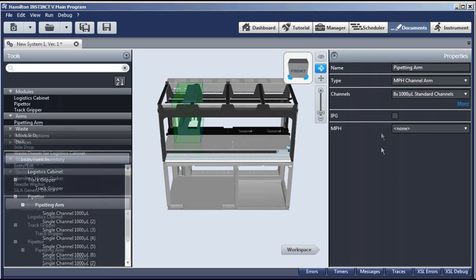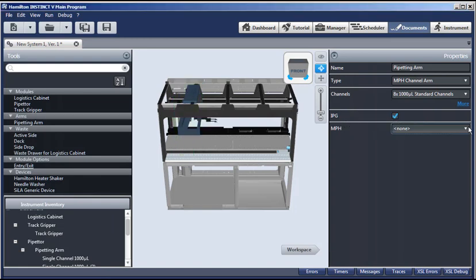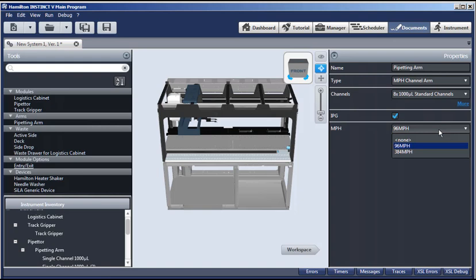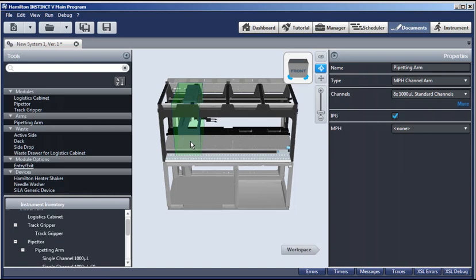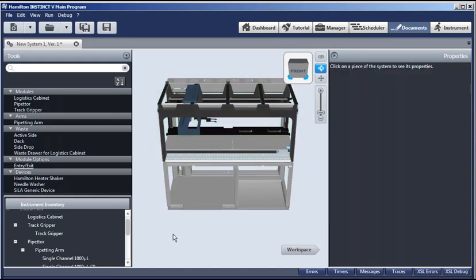And the other information about it is over here in the properties. For example, we can add an independent plate gripper, the IPG, by clicking this box. And you could add a 96 or 384 head. And when you do, you'll see it appear. We won't be using that for this video, so you can change it back to none. And any mistakes you made, simply select the item. You can use the right mouse click and delete it. So it's that easy. Click in the open area, and everything is back to the way it was.